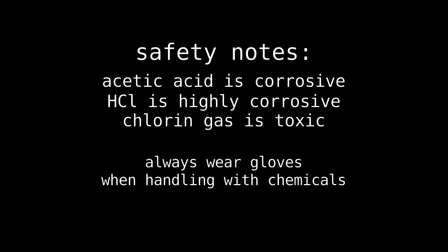Today we're going to be synthesizing chloroacetic acid by direct chlorination of acetic acid, glacial acetic acid in this case.